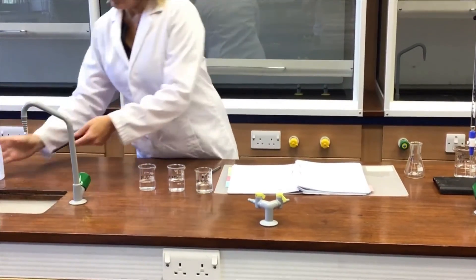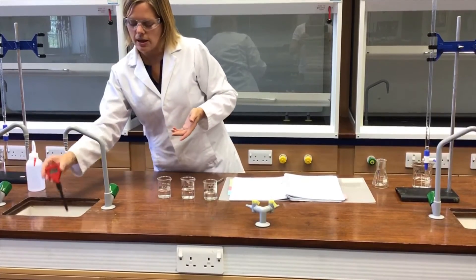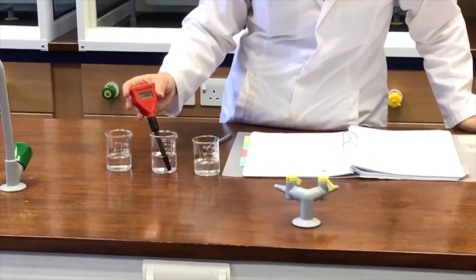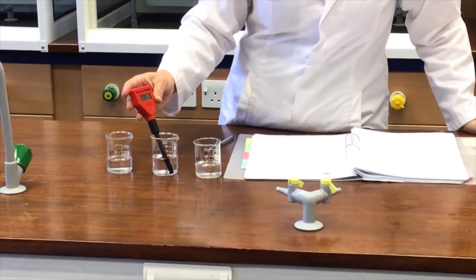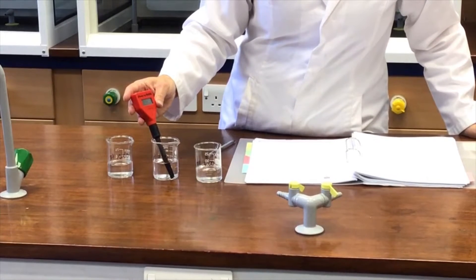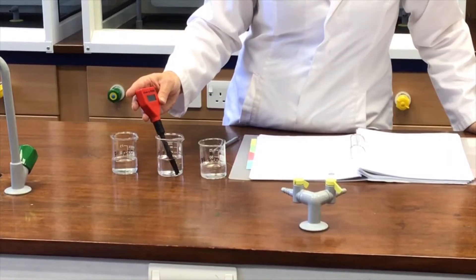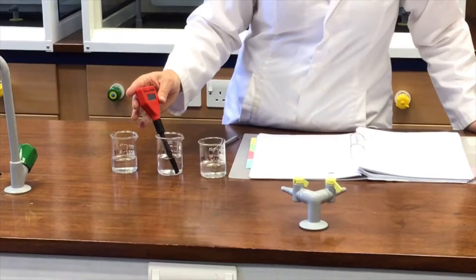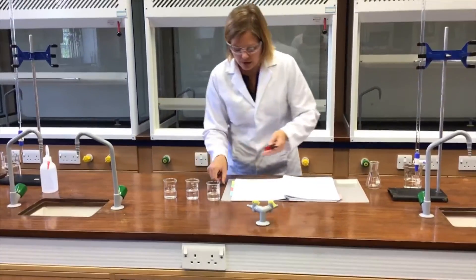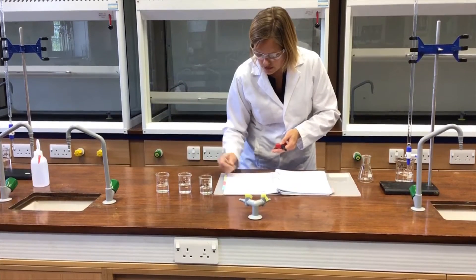I need to do that at a number of different places on the scale so that we can cover a good range of pHs. This time the buffer pH is 7.00, so again just give it a little bit of time to settle down. It's drifting around slightly, and it seems to be settling now at 6.71. So buffer pH value 7.00, meter pH value 6.71.